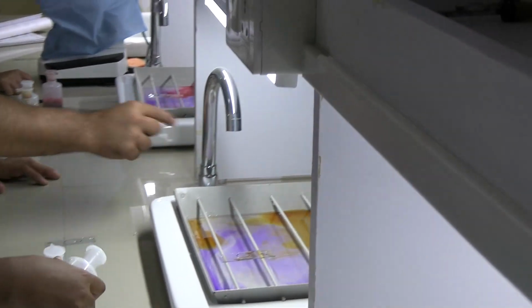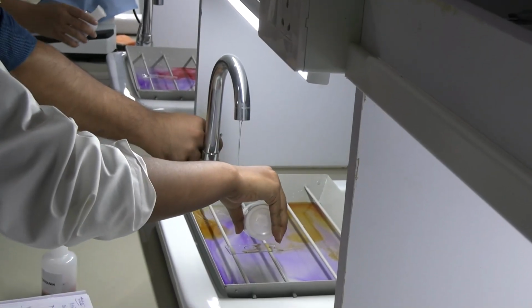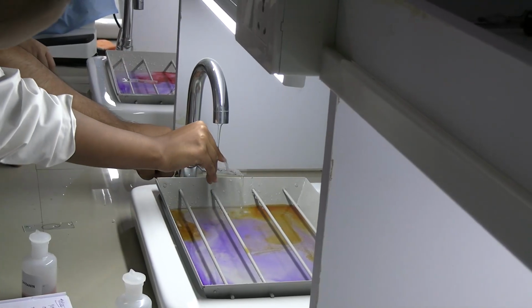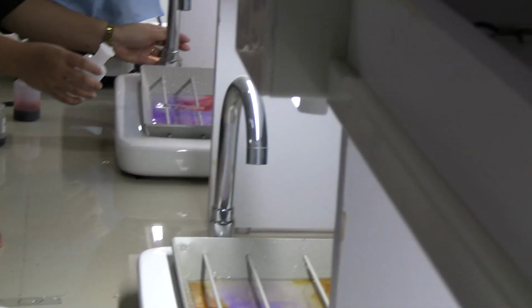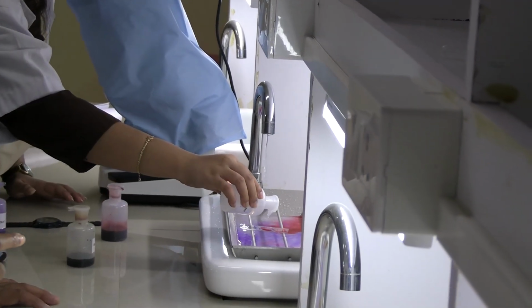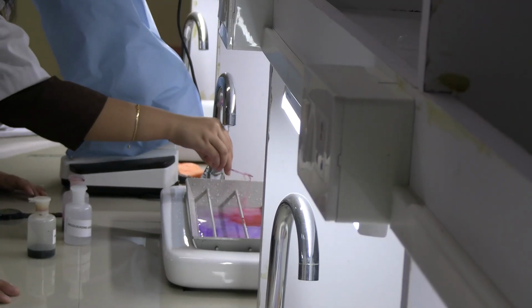Acetone you're gonna drop and quickly you're gonna wash. Wash it on the tap. Same. Done. You're gonna drop it quickly and you're gonna wash it immediately. Wash it. Otherwise it's gonna go away. Everything is gonna get washed.